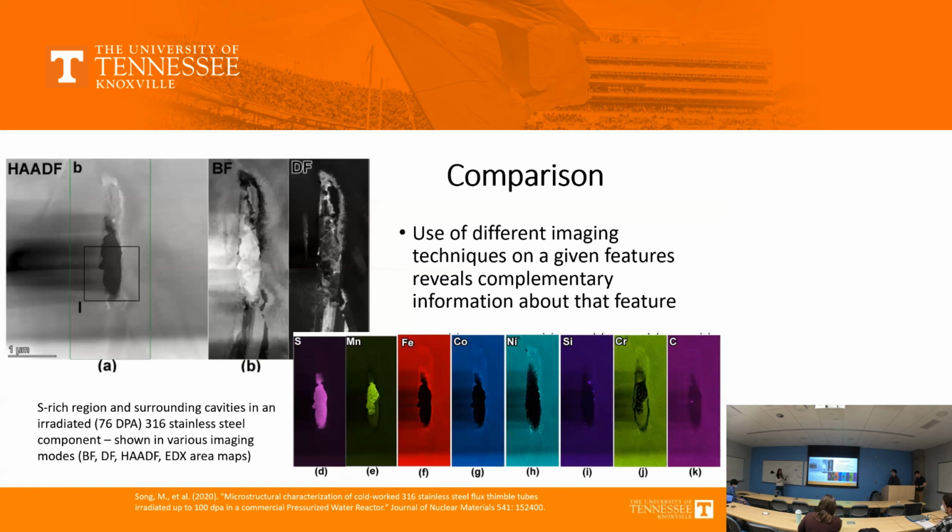Different terms, and this presentation makes it very handy, this is what you're doing, rather than me giving you a bulk of slides and telling you to do it. So these are very handy, with the different examples and all these discussions, which are also there in your recordings. So this is important. Like we discussed why we do 2D versus this thing here. There were important points between CBED and SAED, and low angle and high angle.